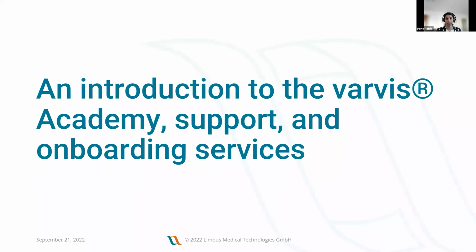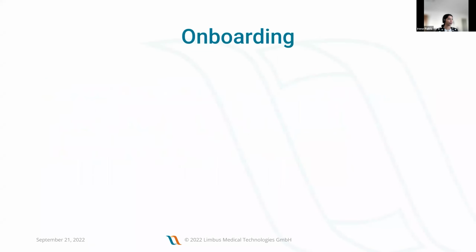So I will give you some overview into what varvis Academy is, the support system and the onboarding services that we offer to users.